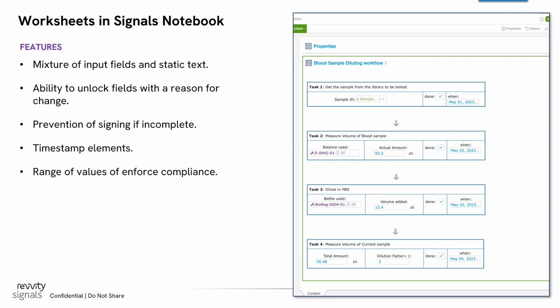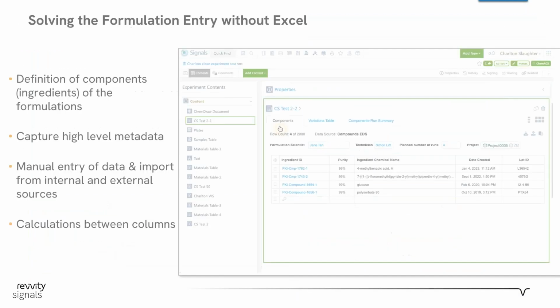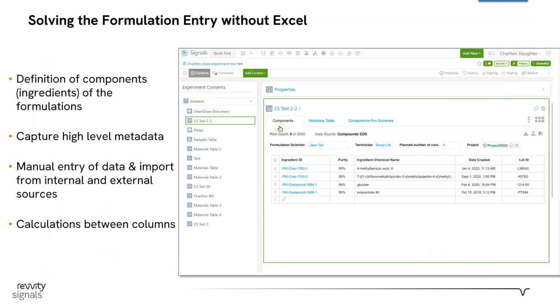It's about making it as easy as possible to structure the data in traditionally unstructured data. For example, entering a timestamp. This is really very, very simple, but as you are running your experiment, clicking on a button to insert a timestamp is something that is small but helpful.